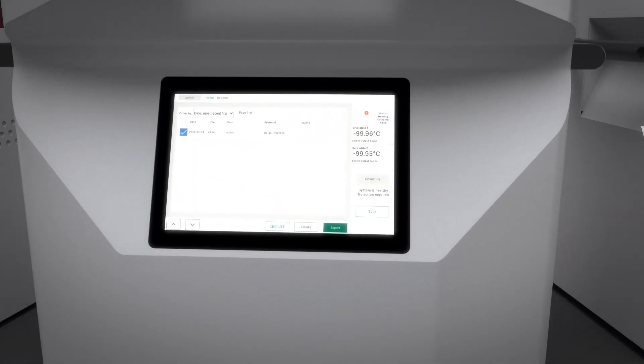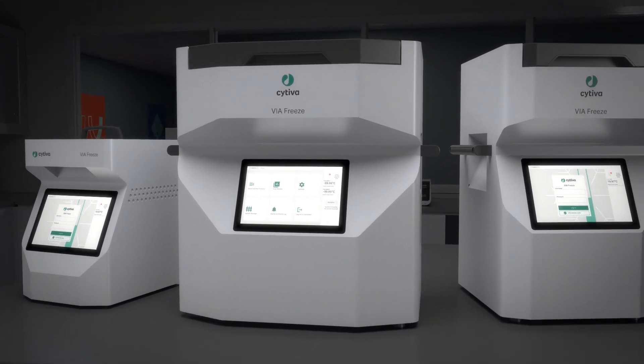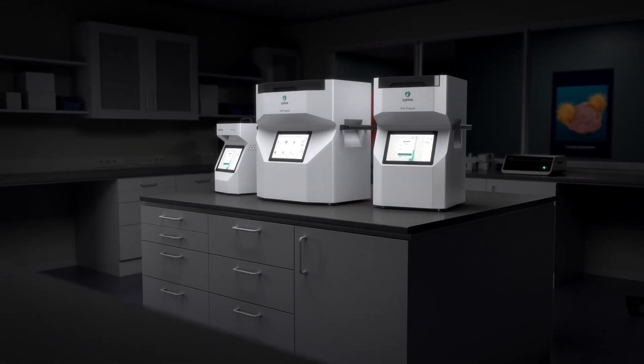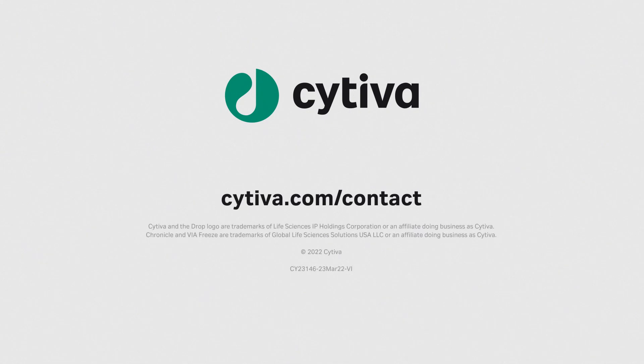ViaFreeze instruments give you controlled cooling with consistent quality for cGMP-compliant cryopreservation that can scale easily to meet your needs. Contact Cytiva for a ViaFreeze demo or to learn more.